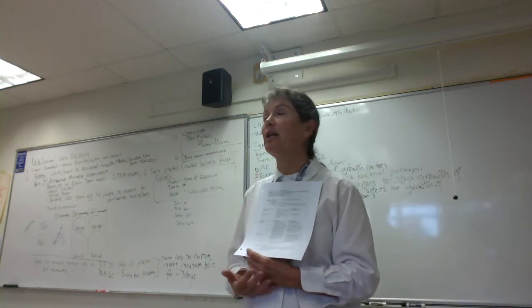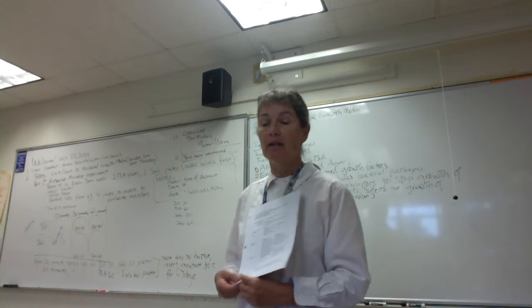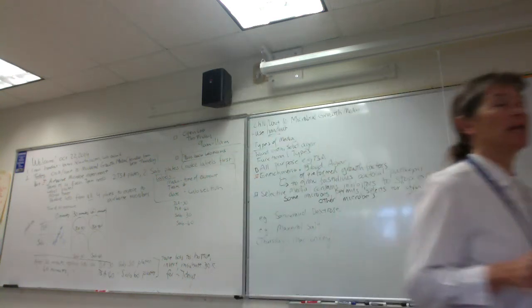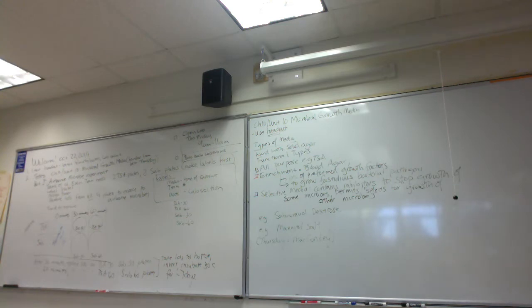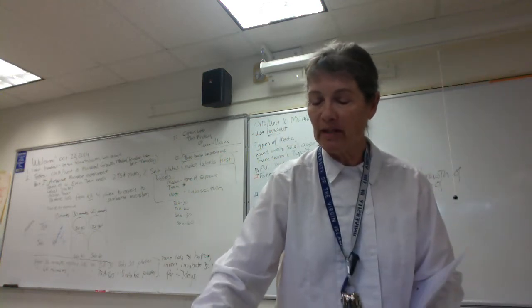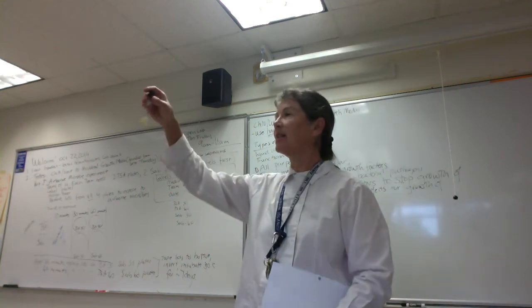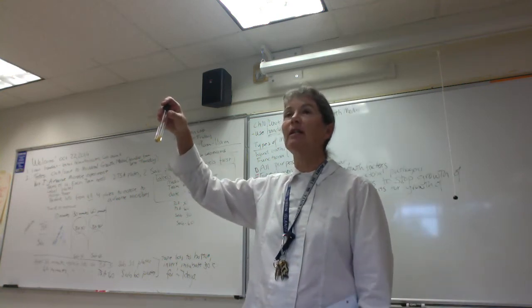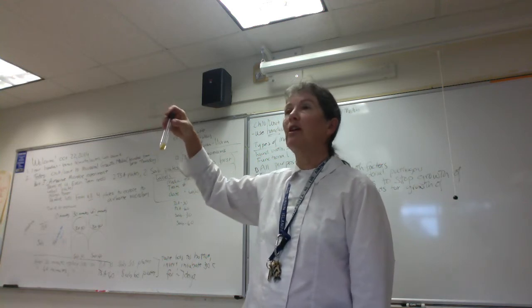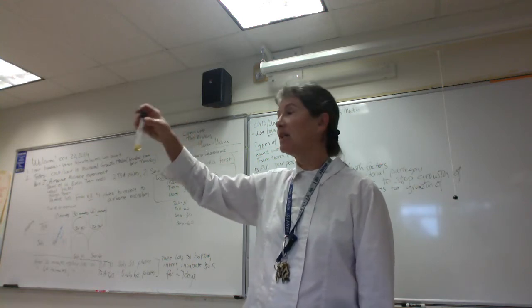So the simplest way is to classify the media based on the physical form it takes. So if we have a liquid media, what would we call liquid media, folks? Broth, yeah. And just think of chicken broth, like chicken soup. That's what I think of. Broth, it's like a soup for our microbes. And just like we eat soup to get nutrients, we can make a soup or broth for our microbes to feed them so that they can grow.